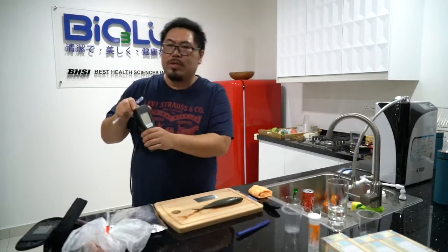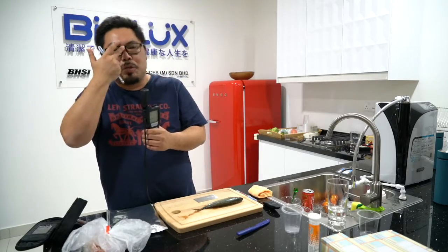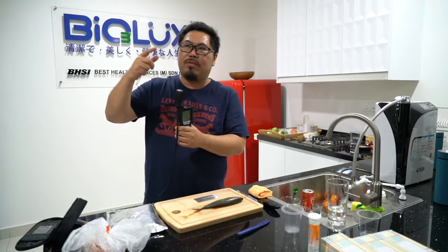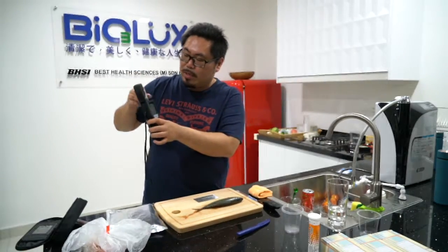In between thirty should be safe — under thirty is good. Above thirty means contaminated. Above a hundred, like, heavily contaminated.